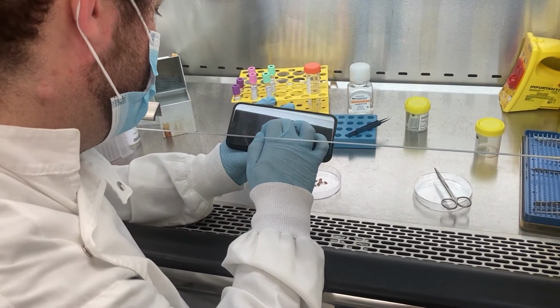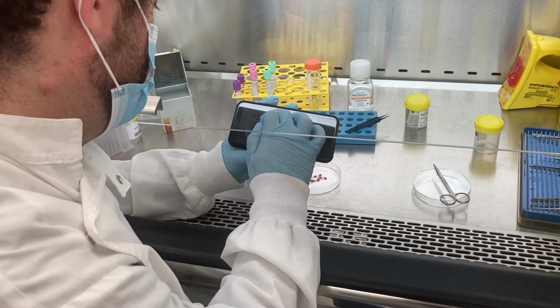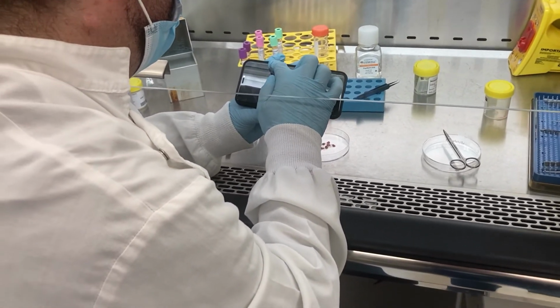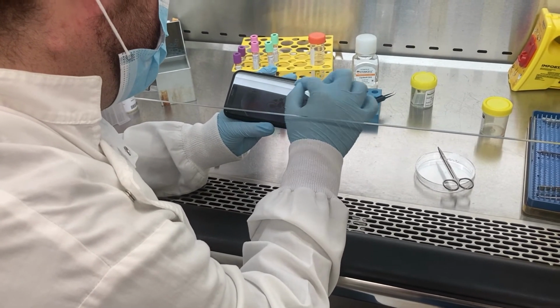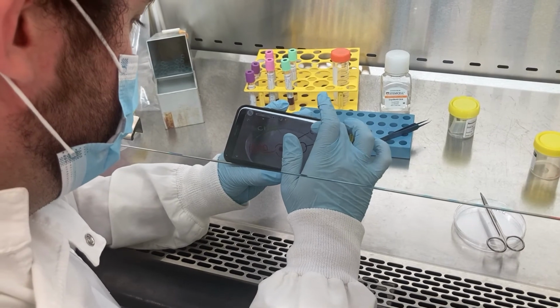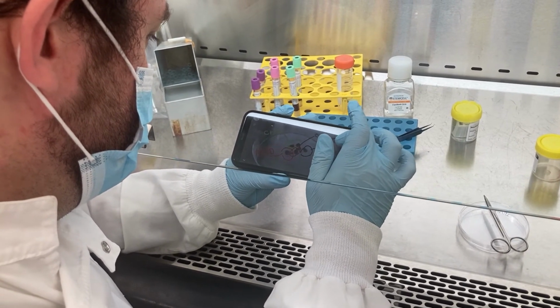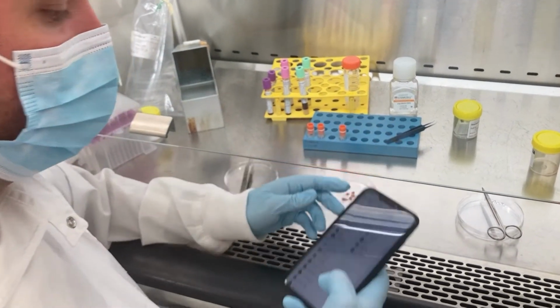These parts, I think, with a cryopreserve. And these parts here, I might take for organoids. Save that. And then what you do is just send it to your research team.